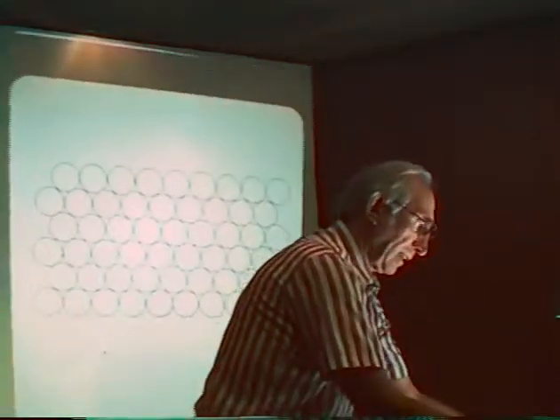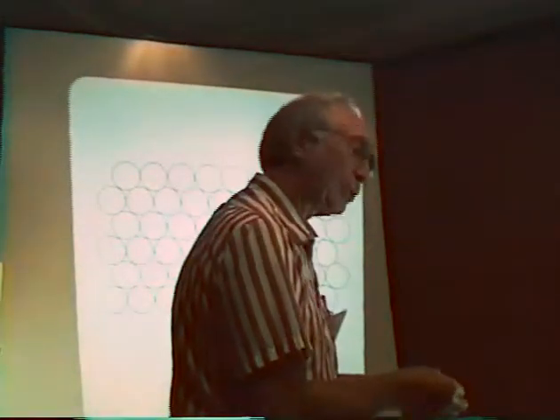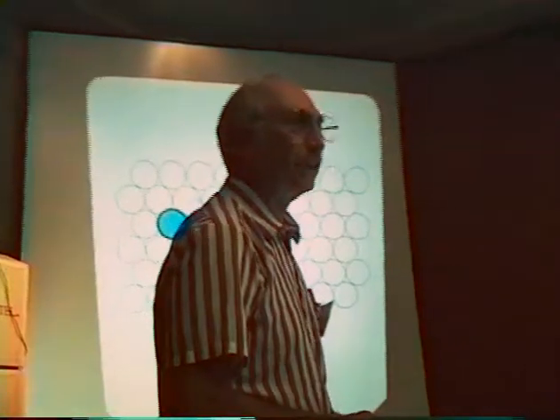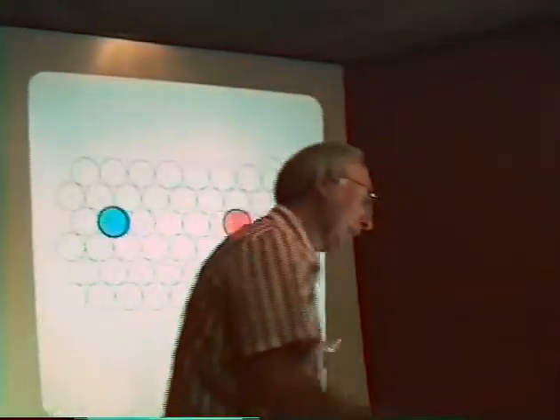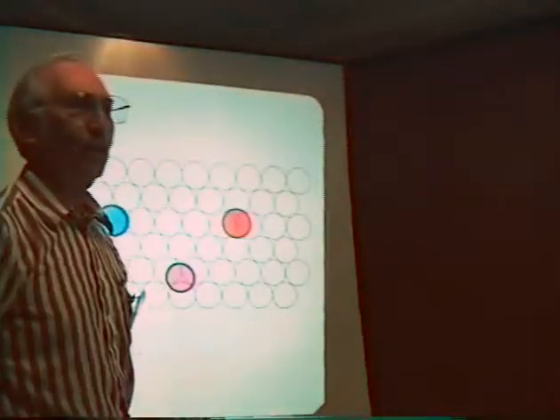And so the first picture is one which appropriately dates to the paper which started all of this. And you see some bands which come from putting a CO molecule linearly bonded to a surface atom. We see some other bands that come from CO molecules bridge bonded to 2, and some others that result from bonding to 3 or more.